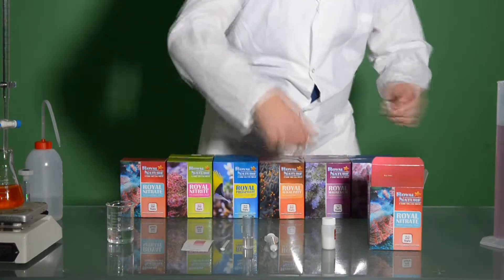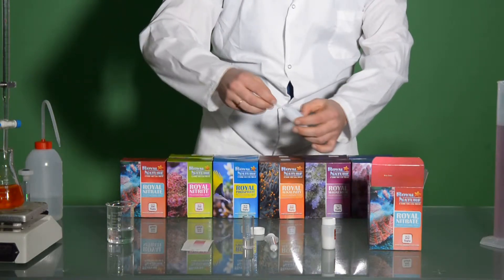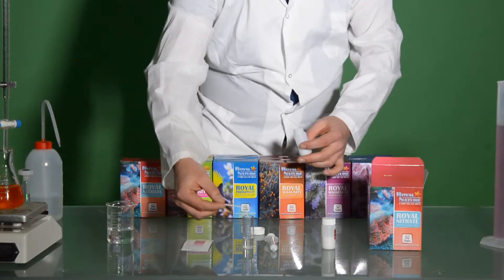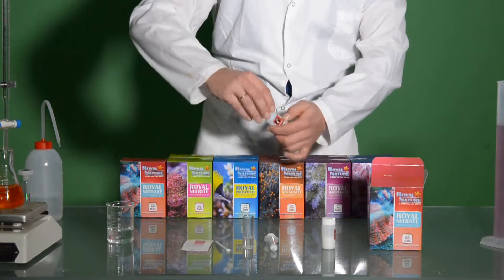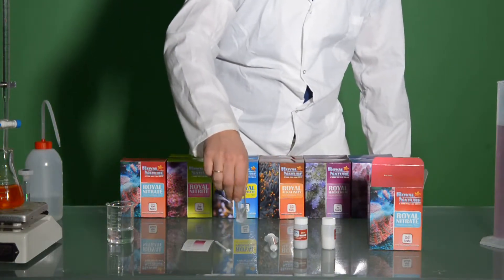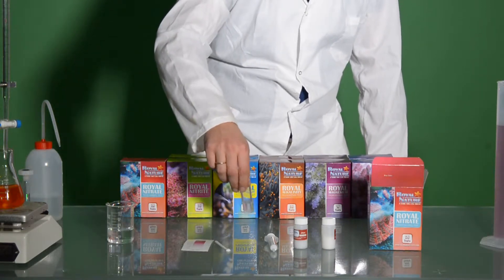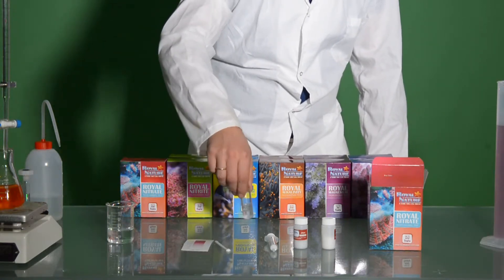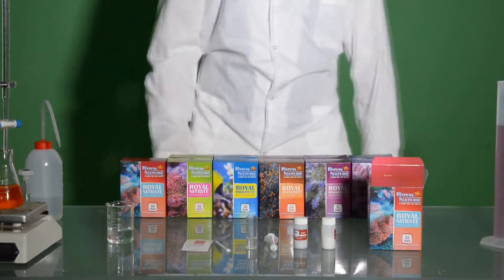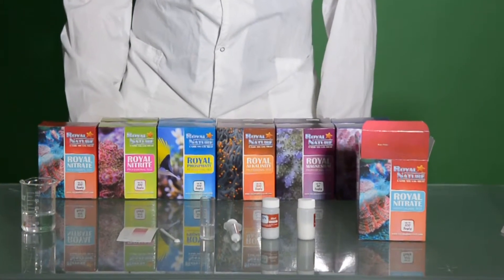Now we are going to add one level scoop of NO3-2 and swirl gently for another 30 seconds. We'll let it stand for 5 minutes. In this time, you can do another test and not spend your time just looking at the test vial.